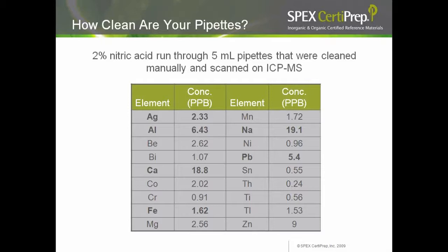The ICP-MS results in microgram per liter are shown in this table. As you can see, silver, aluminum, calcium, iron, sodium, and lead are very high.